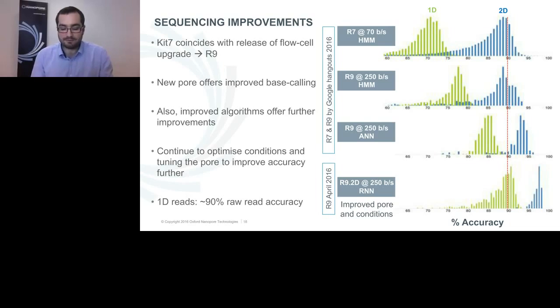Forgetting about the fact that the nicked and gappy sample also has a much lower percentage of 2D reads and shorter read lengths, the amount of data that you get is also vastly reduced. So they are a problem in terms of the total yield, and the quality and read length are also reduced.